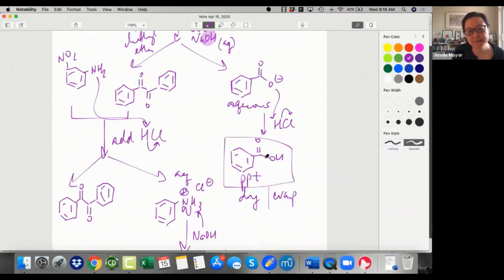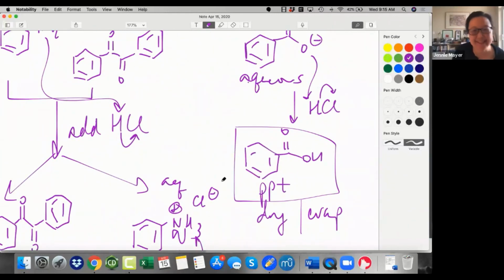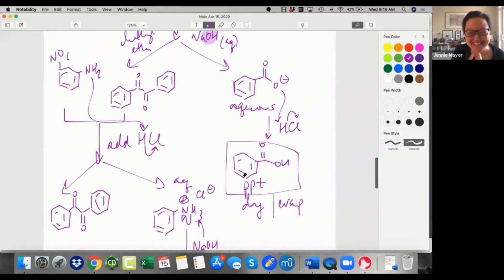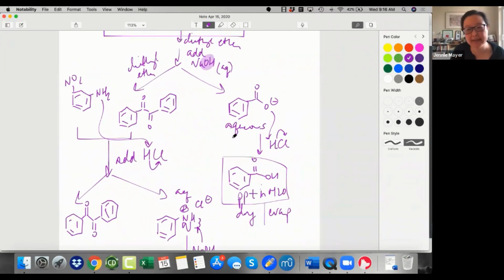Yes. So that's why we use a base again to go back. An acid in this case and a base in this case, yes. It's confusing because you have acid and base. And yes, it will precipitate in water, which is what it's in at this point. It's in water and it becomes more nonpolar. So it will start precipitating white powder everywhere in your test tube.